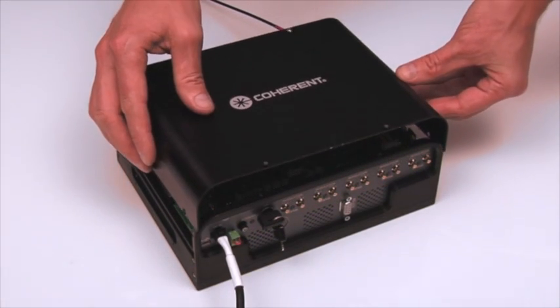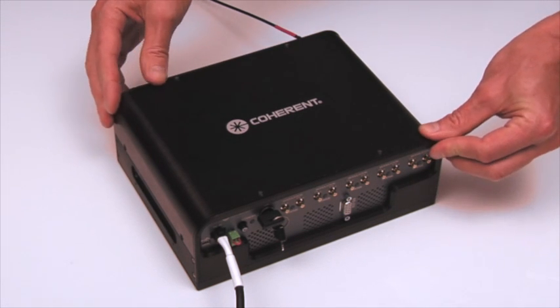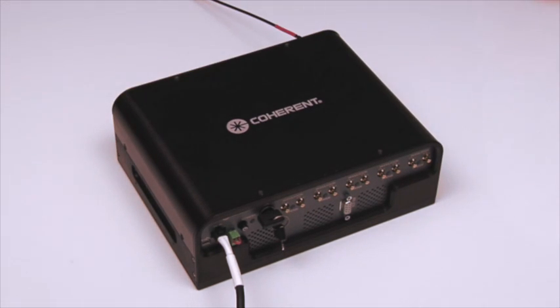The laser box lid can be reinstalled with eight screws securing it down, and that completes the laser box assembly. It's a very convenient way to mount up to five different OBIS lasers with thermal management and complete control.